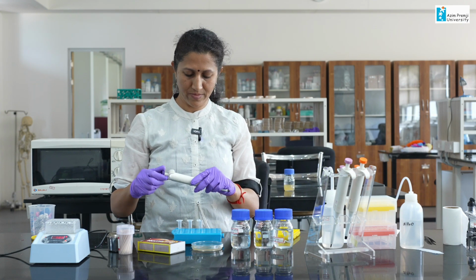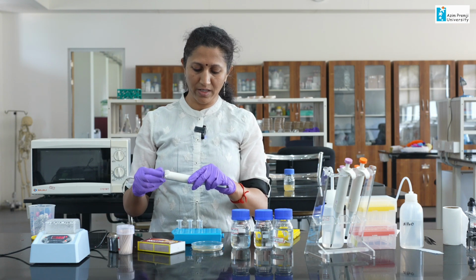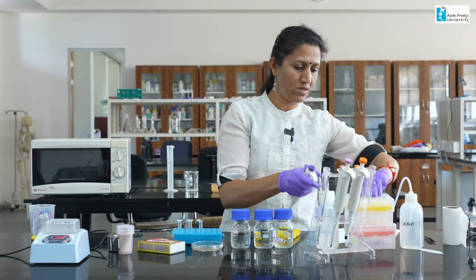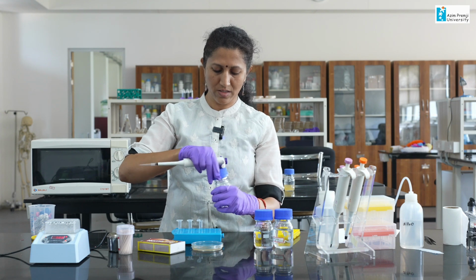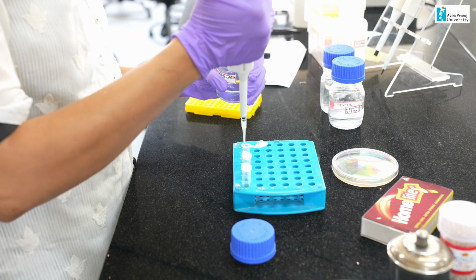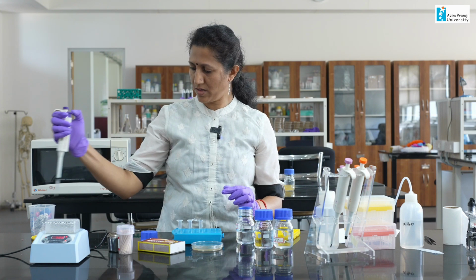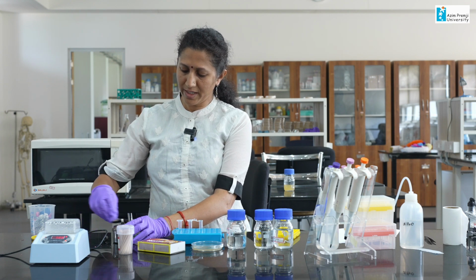I will set my micropipette. I am going to pipette 27 microliters of this into a clean Eppendorf tube. Into that solution, I am going to add the bacterial cells.